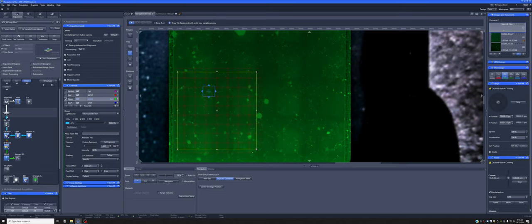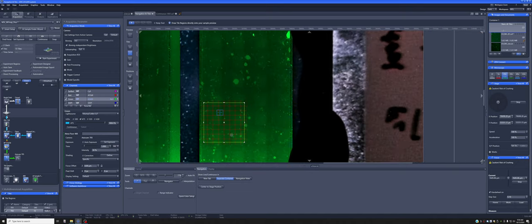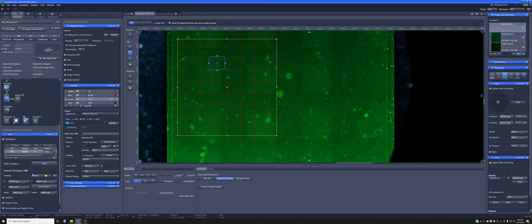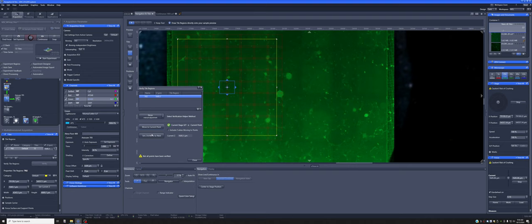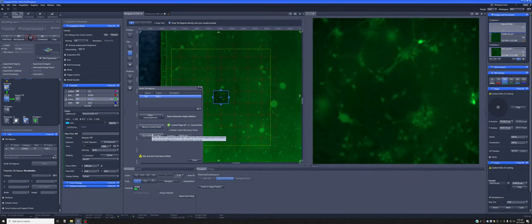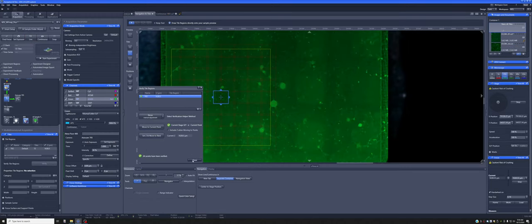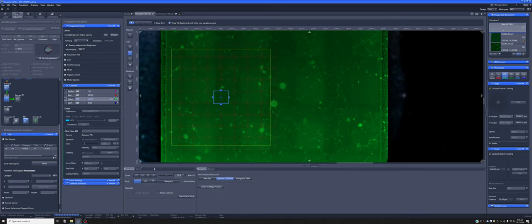So for example, this, which for confocal, this would take a while. But you'll see that for this modality wide field, it's actually not going to take that long. So I'm going to delete this. I think this is from a previous thing I was doing. And I'm just going to check that the focus is okay. So I'm going to move to the current point, which is the middle. Just go to live. Let's see here. That seems about right. Stop this. Let's say set Z and move to next. So that's good. And then I'll just say start experiment.